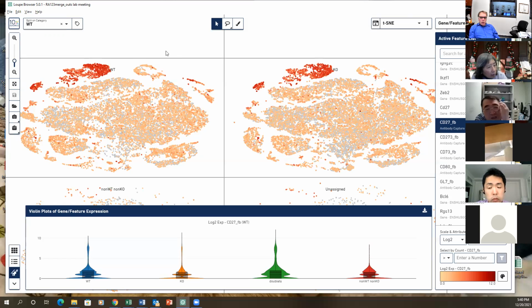Just now, do we need to download a later version? Because she keeps saying she's got the old version or something. I think it's better to download the latest version. No, I think Sharon's right. Otherwise, somehow it's just not that fast. What's the name of the latest version? The new version 6.0. Yeah, but it's not 5 for sure. 5 is from June, 3 months ago. All right, we'll download that.